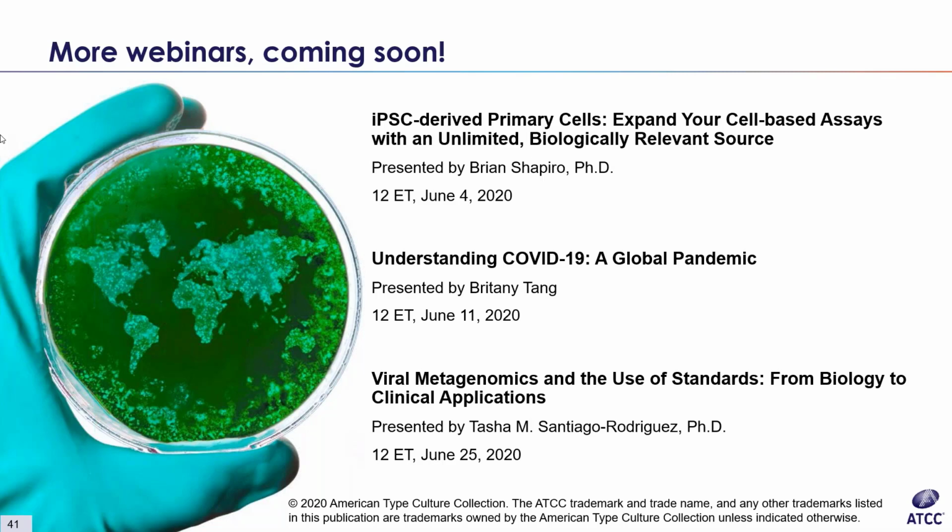It's probably not going to be 100% either way. It's a little bit random when doing a transfection reaction. It goes to the cytoplasm, and it can either stay in the cytoplasm or transfect into the nucleus. You can't directly control that other than by optimizing that ratio. By doing that, you increase your chances of getting it into the nucleus.